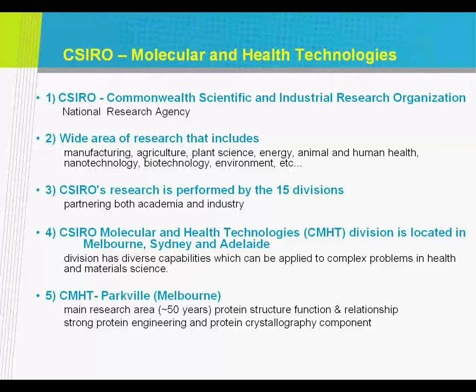Now, the Biomolecular Interaction Facility in our building. I only started calling it that recently, but essentially we've had SPR instruments here since 1994. That was the good old Biacore 1000. More recently, we acquired the Biacore T100, and very recently, about a year ago, we acquired the ProteOn XPR36.